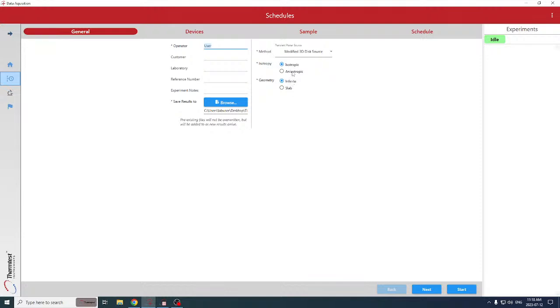What are these other options? With that same MTPS sensor, you can measure single-sided anisotropy and single-sided slab. So this is a very capable modified transient plane source sensor that makes measurements in an absolute way. What does absolute mean? Absolute means that from the raw data of the output of the sensor and system, the thermal physical properties are calculated. And that provides a tremendous amount of flexibility. That flexibility being the ability to vary time and power. And I'll talk a little bit more about that.